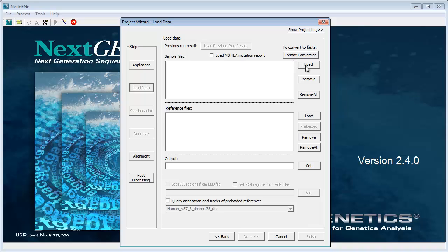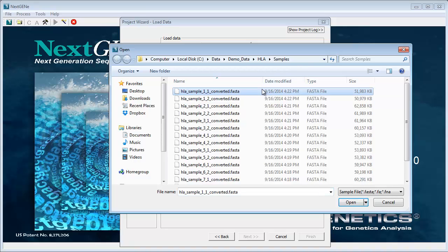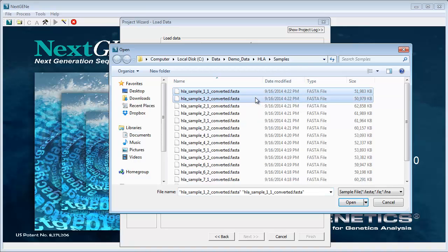Otherwise, click Load and browse to and select the sample file or files for a single sample.